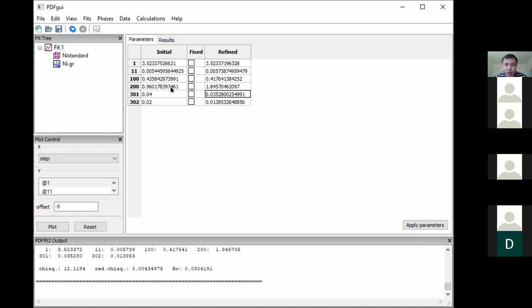So, okay, I think we already talked for more than an hour, and even though we only covered the nickel standard, I think we spent quite some time exploring the structure of titanium sulfide, and particularly the information to extract from the VESTA software. So we might as well stop here. We can probably save the fitting on the real titanium sulfide data for the next one, and we can go further from there.